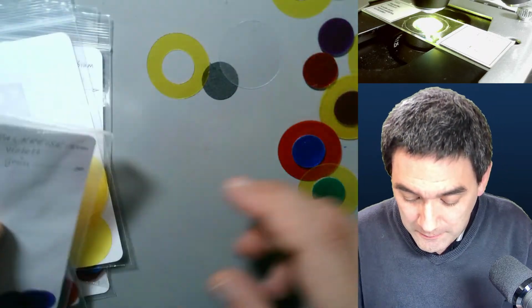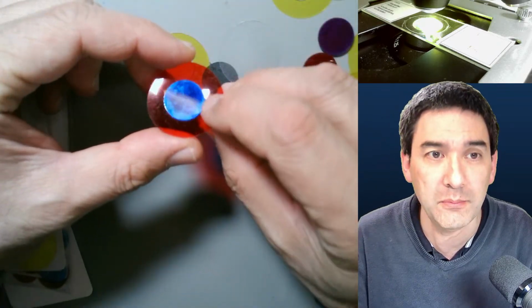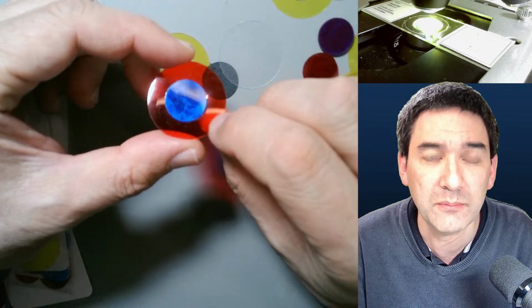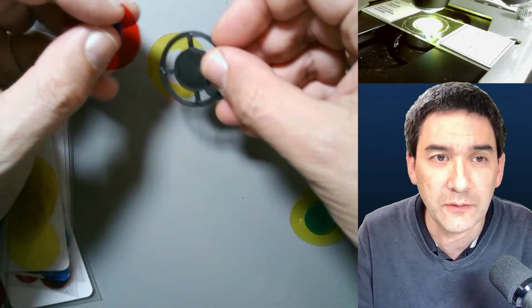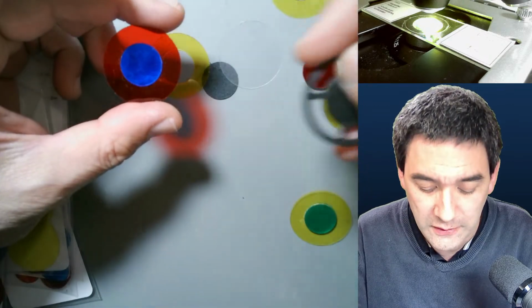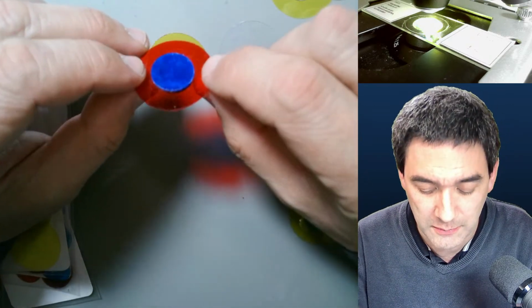First of all, those Rheinberg filters, basically, you can see that they have a colored disc in the center, and on the outside a periphery of a different color. So it's here. This is a dark field filter that I made. So it's basically a variation of dark field, but the images look quite a bit more different.